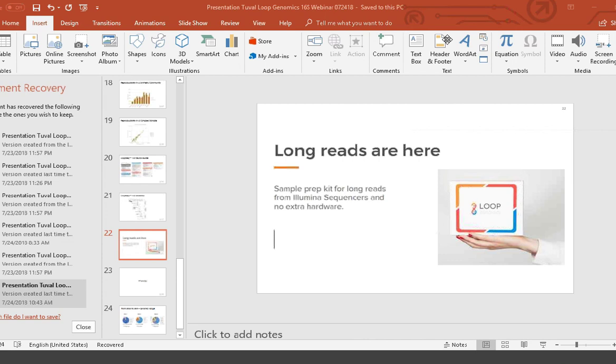How do you distribute the barcode randomly within the molecule? It's a great question, and that's the part of our chemistry that was developed for almost a decade in multiple research institutes. A lot of that technology is proprietary, but what I can say is that we've developed an enzymatic system that enables us to take a barcode sequence and copy and paste it randomly into the same molecule intramolecularly.